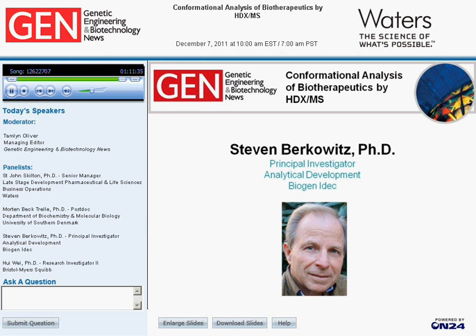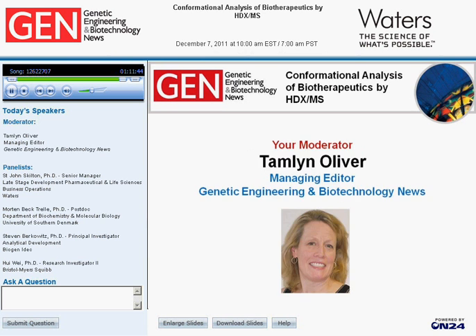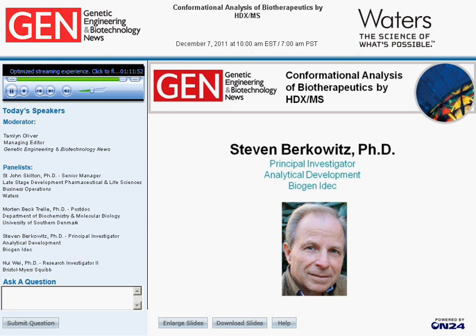Okay, Stephen, I have one more question for you. How do these plots vary when multiple data sets are analyzed, and are there any additional statistical insights? Well, we think this is an important aspect in trying to assess comparability, to try to bring this to a more quantitative level. So far, we've taken some very elemental steps to do that. The data that we report are averages, and we do at least 3 measurements over several different days.